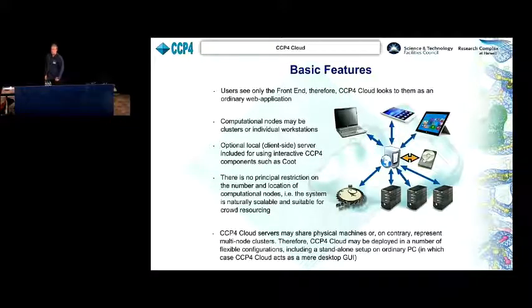But you can also install this locally on your PC, and then it will work as an alternative interface to CCP4, like the desktop, as an alternative to CCP4 i2.